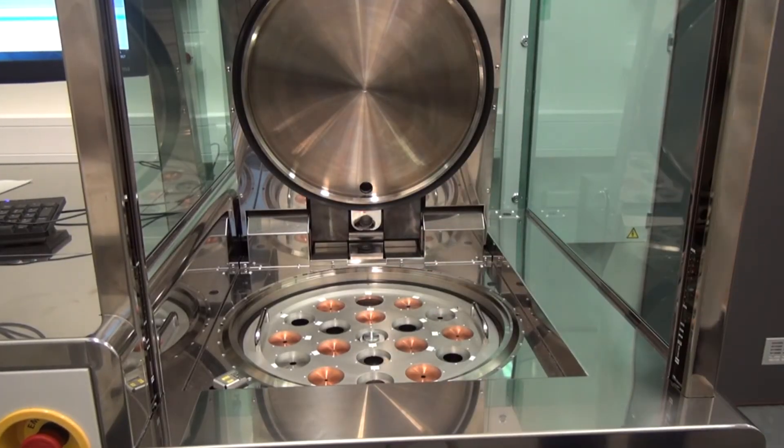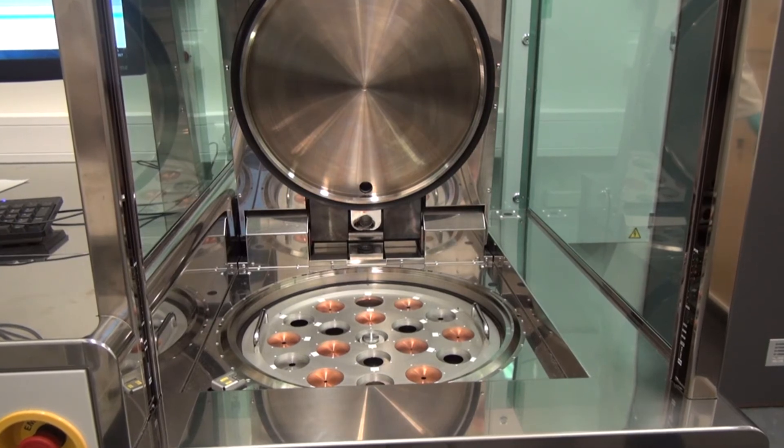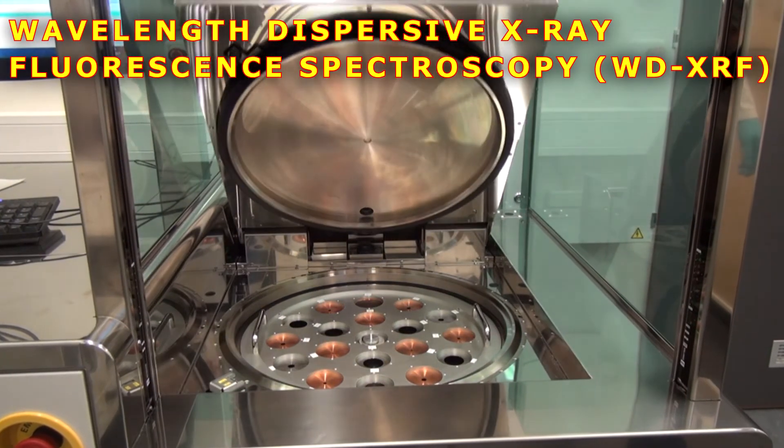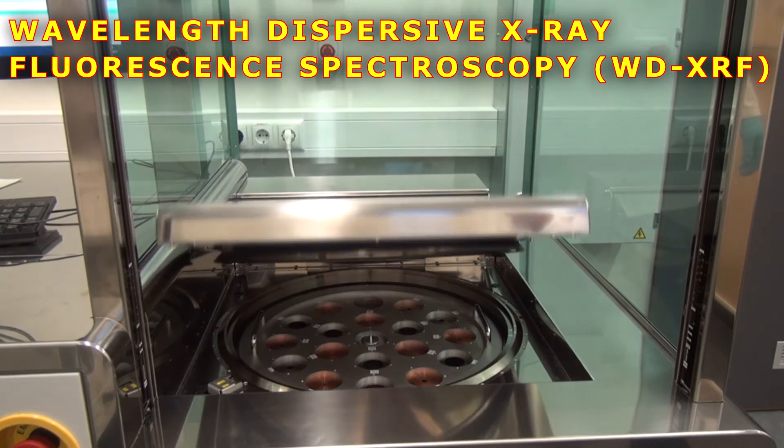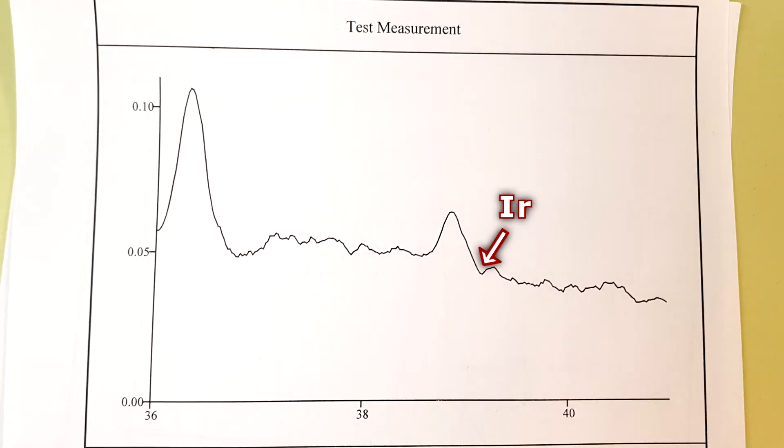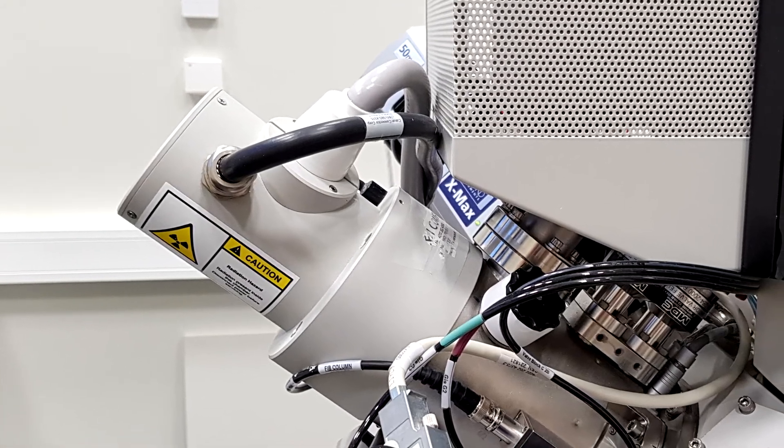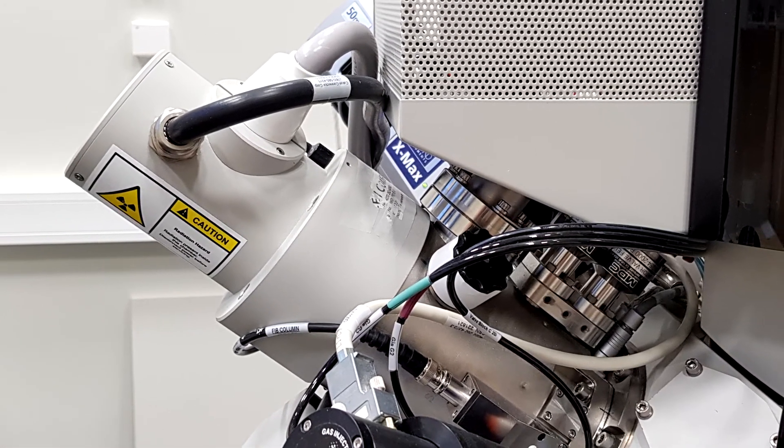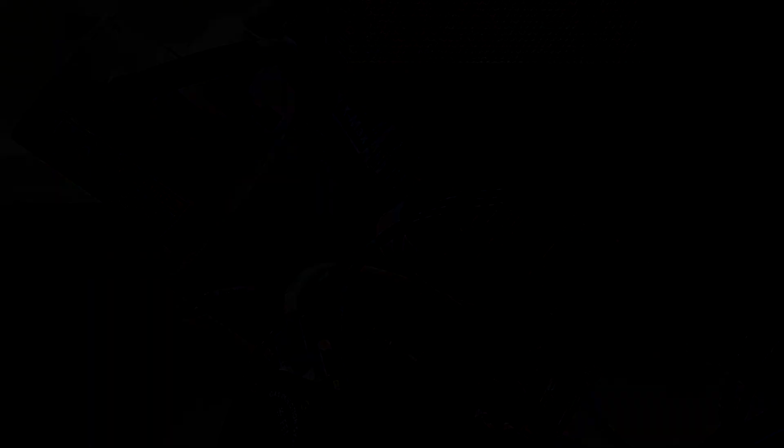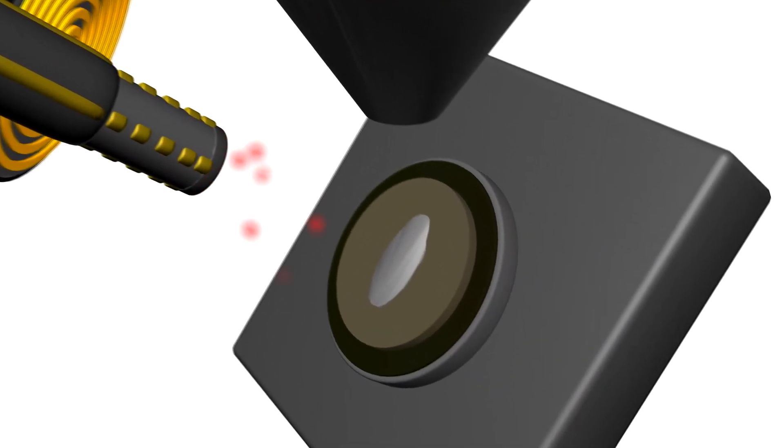Unfortunately, this was not the case, as a more precise measurement with wavelength dispersive X-ray fluorescence spectroscopy showed that instead of iridium, we have small amount of gallium in our meteorite. But this is also awesome, as gallium is used as a source for the very same ion gun that is attached to our scanning electron microscope and regularly used to study the interior of samples.